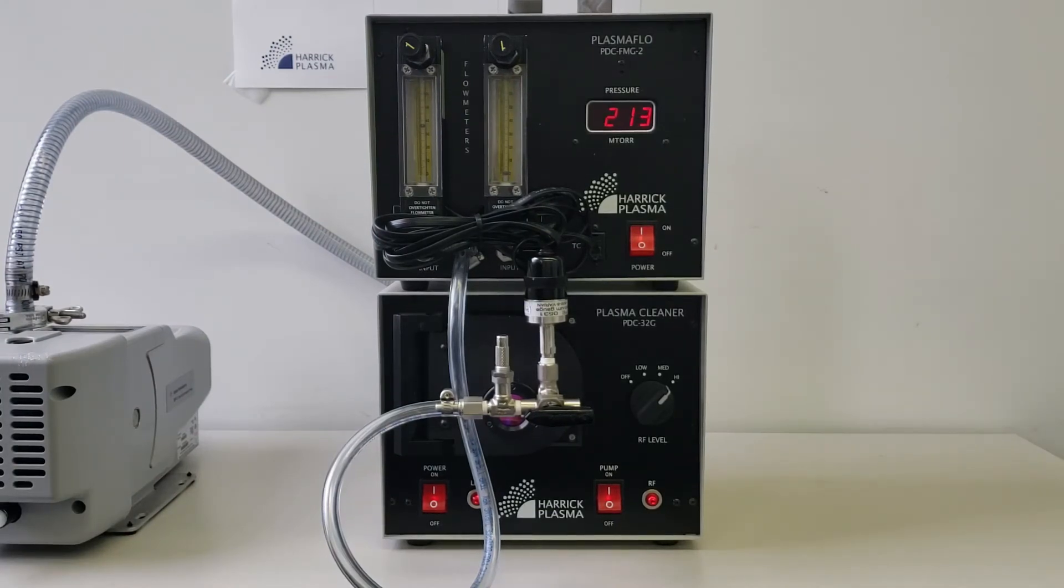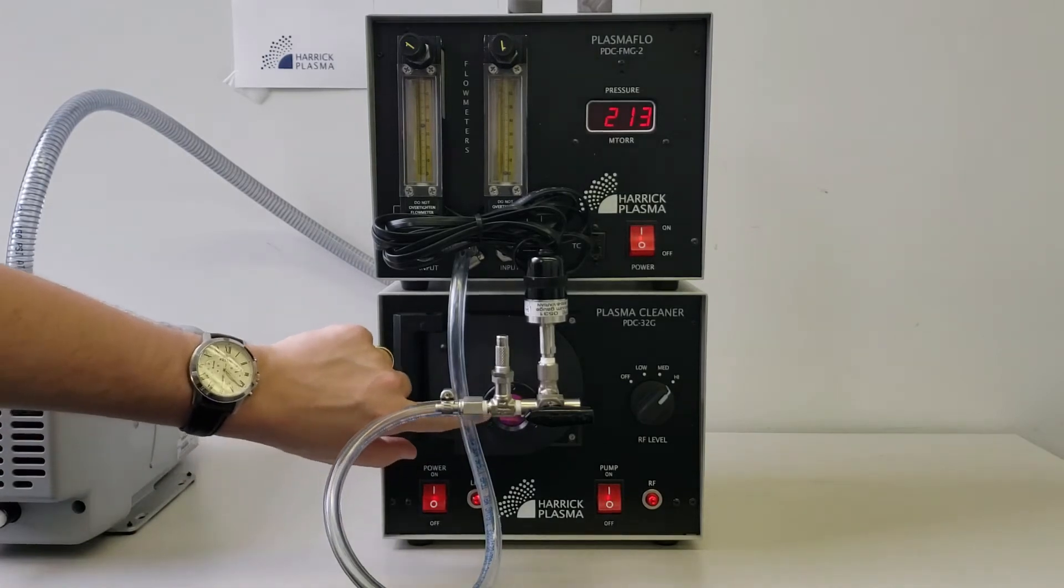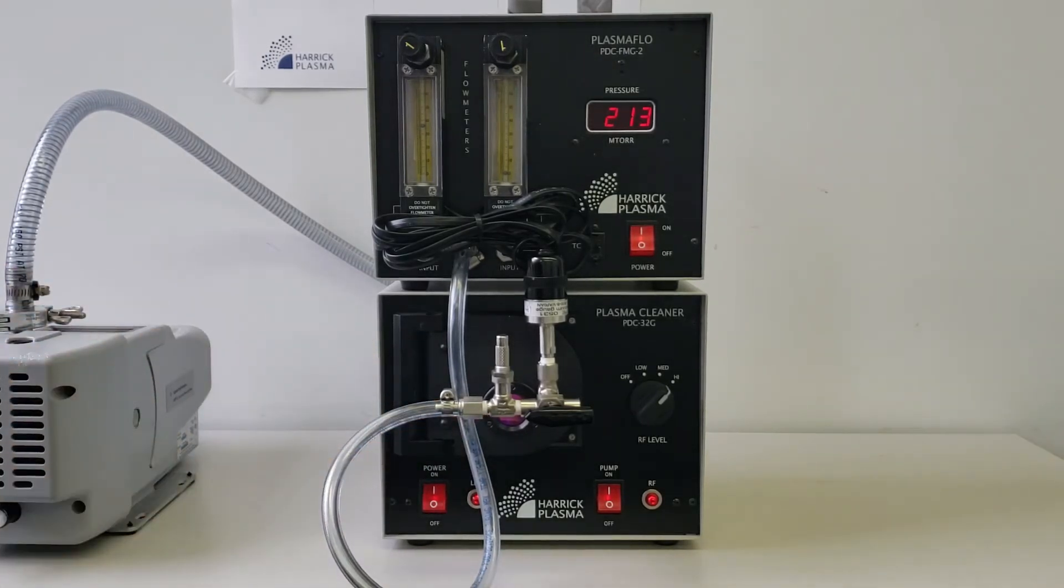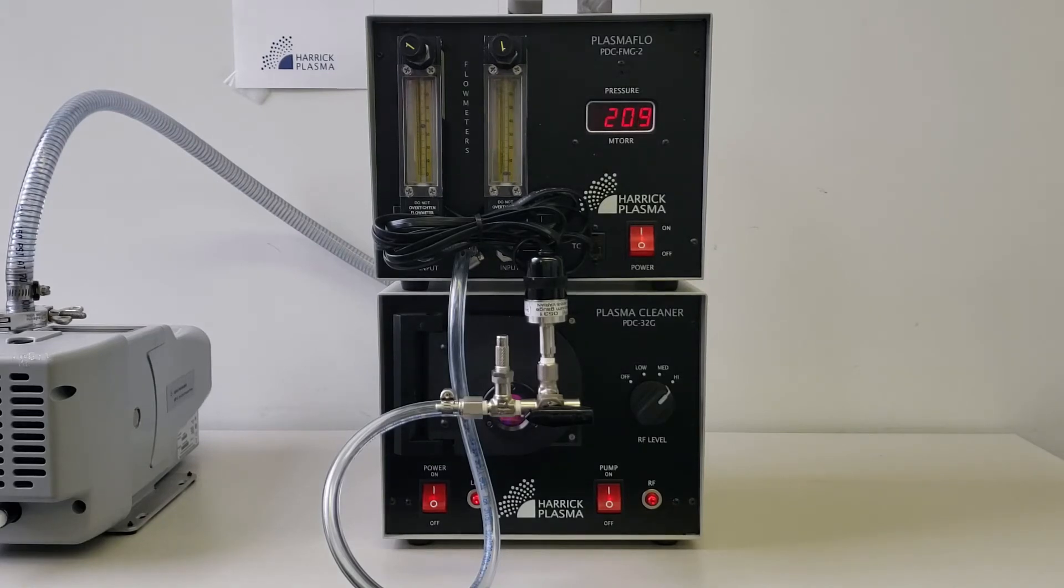While air plasma is a visually intense purple or pink, oxygen plasma is a much less intense blue or white color. We highly recommend using a vacuum gauge during plasma treatment to ensure process consistency. In some cases, oxygen has been found to be more effective for bonding due to a higher concentration of reactive oxygen species.